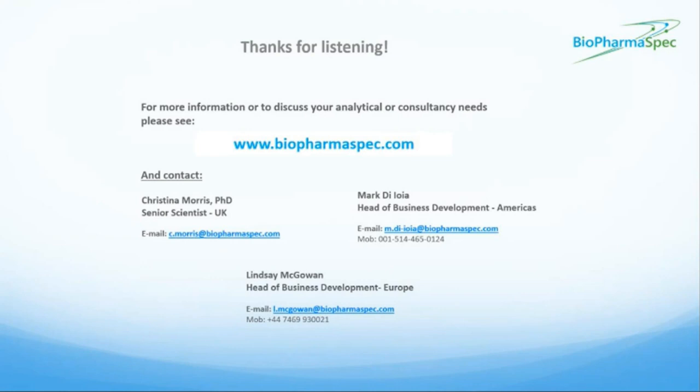Thank you. Next question. Are there any particular values for HCPs allowed during the production of biotherapeutics in different hosts and the accepted methods to quantify them? There isn't a single universal test for HCPs. It will be specific, again, to your product.